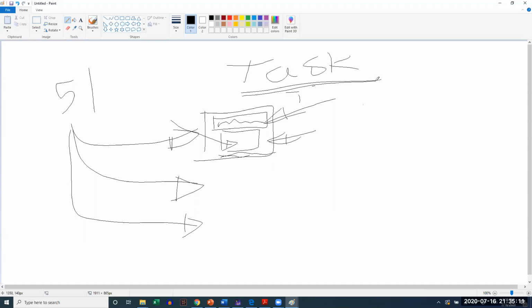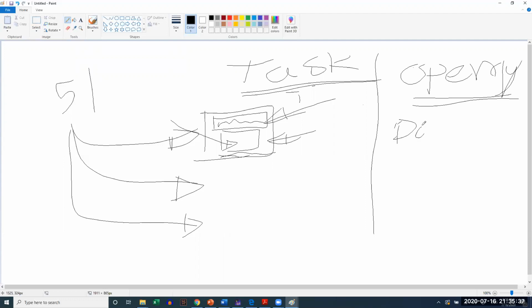And then you go for the particular detailed task. Since you want to do some image analysis for these gel images, what I will say is you learn to install OpenCV on Python. There is one good tutorial on Instructables by myself and Mr. Amit. And then you can also try and download one gel image.